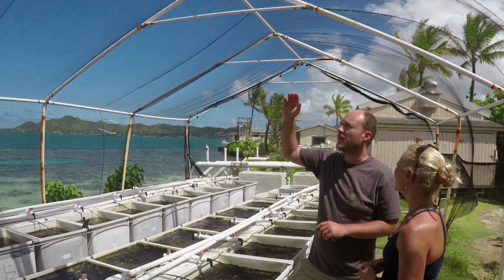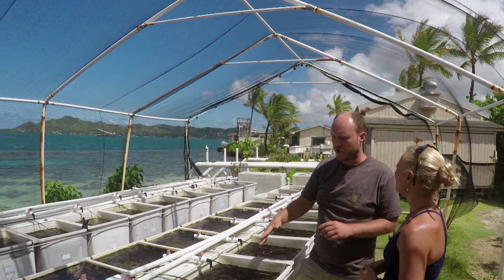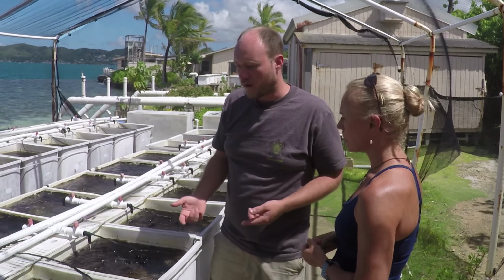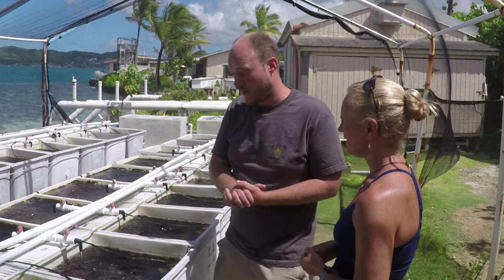So we've got natural sunlight attenuated with shade cloth so that we've got light levels that are similar to 5, 10, maybe 15 feet deep where these corals were collected. We have a lot of water flow in these tanks generated by seawater pumps as compared to what is often used in these sorts of experiments. If you go to a coral reef, pretty much anywhere, even a relatively protected one, you've got waves. You've got a lot of water motion, and that water motion is important in driving all sorts of metabolic processes in the corals and the other organisms.